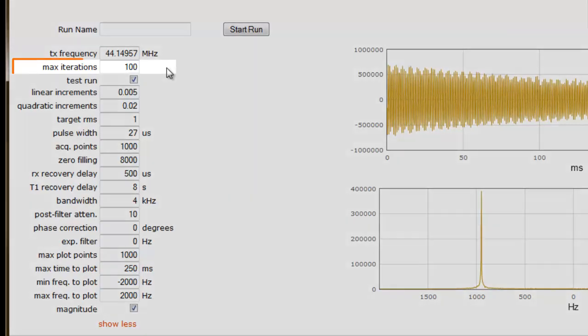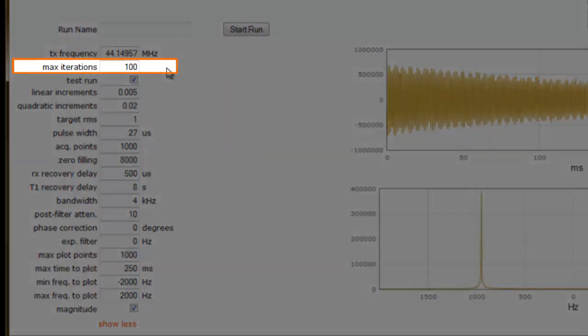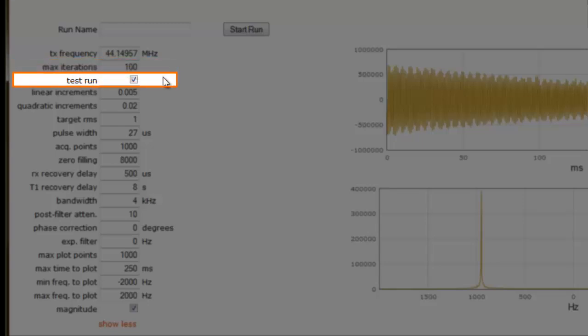We control the number of evaluations of the simplex algorithm by adjusting the value of the max iterations parameter. The test run box allows us to override the execution of the optimization loop of the AutoShim script. Checking the test run box turns off the programming loop, thus allowing us to execute a single RF pulse.